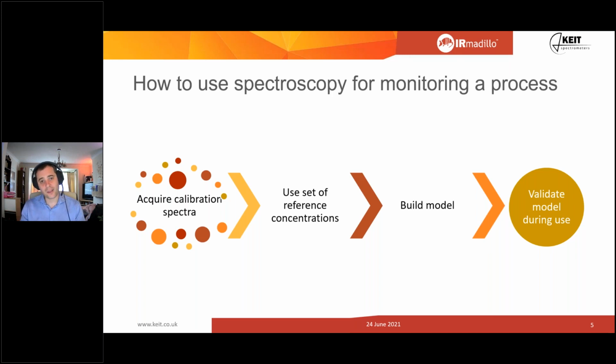So you have to validate, and you validate your model. And you do that by throwing in data it's never seen before. And you ask it to predict what the concentration is, and then you validate that. Was that the right concentration? And we see examples of that all the time. Machine learning algorithms look at things like pictures on Google and Facebook, and then they'll throw in a picture of a dog and say, what is this? And if it says dog, you know it's working. If it says cat, you know it's not. It's the same kind of thing, but for chemicals.